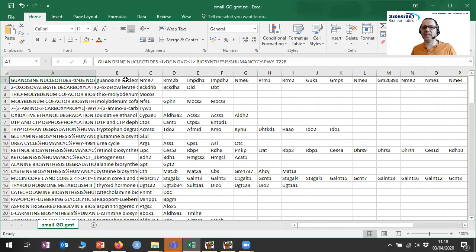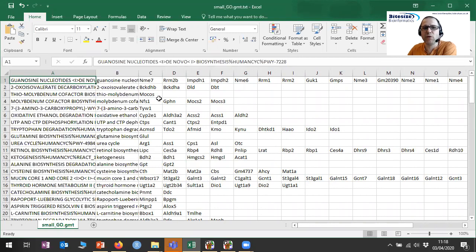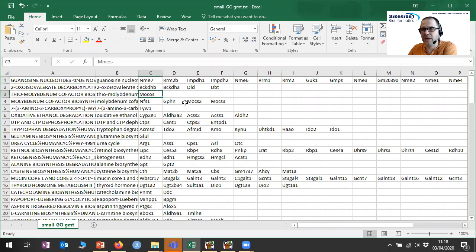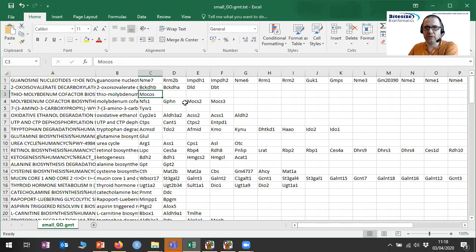If I have a look at what's in the GMT file — I've opened the first few lines in Excel — it's a pretty simple format. All it is: a longer description, a shorter description, and then a bunch of gene names. These gene names have this functionality — that's all it is, but that's what we need for our test. What you can also see is that there's huge variability in the sizes of these sets. Some of them are huge with hundreds or even thousands of genes, and some are tiny — like this one here has only got one gene in it. When we're analyzing this, we'll need to think about how we treat those.